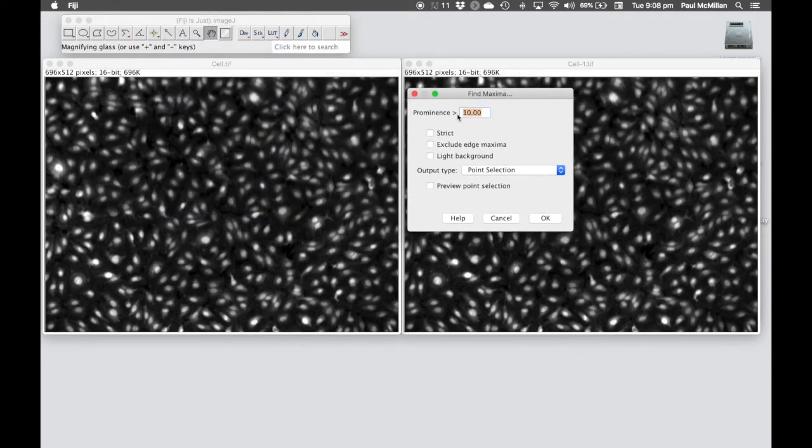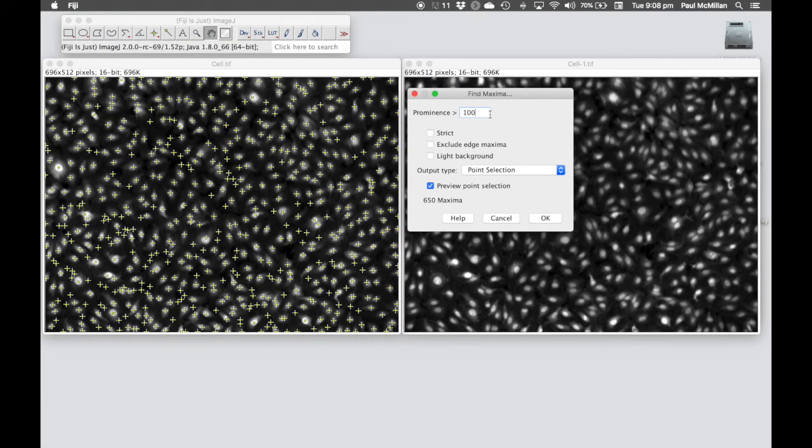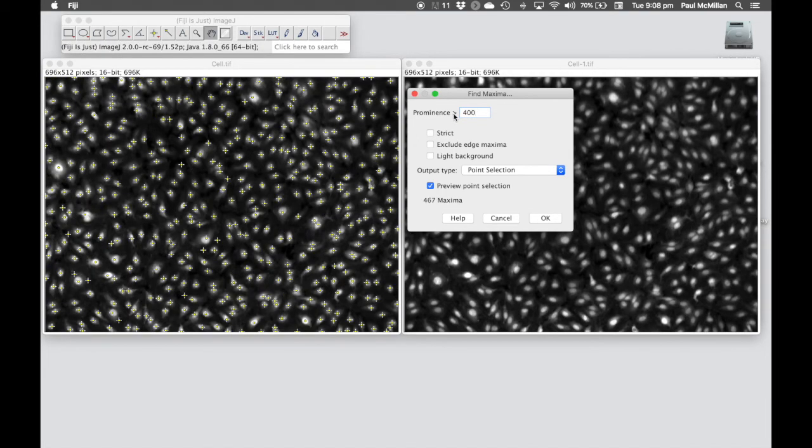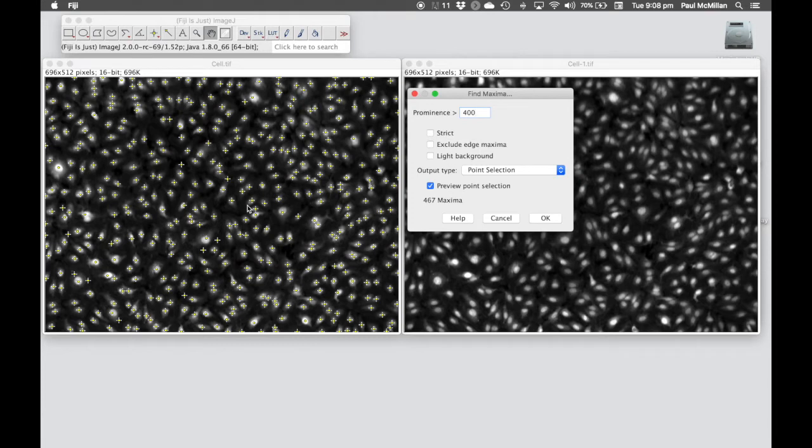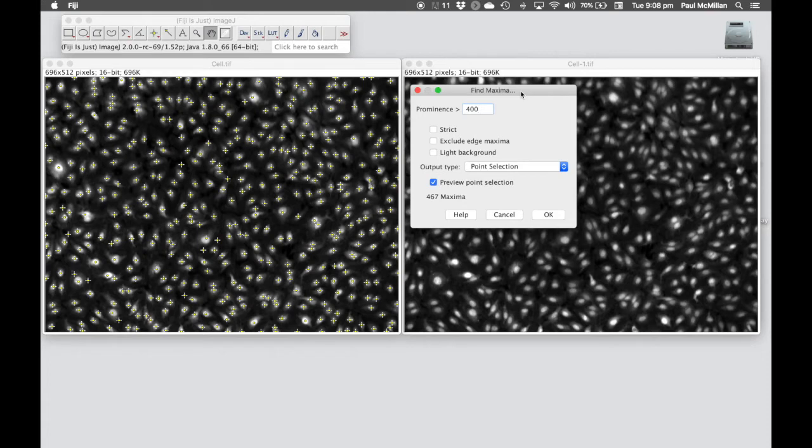Here we've got a prominence value, which basically equates to something like intensity. If we hit preview point selection, it would show you what it's found so far. You can play around with the numbers, but the magic number that you want is something like 400. You should find that most nuclei have only one point sitting within them.